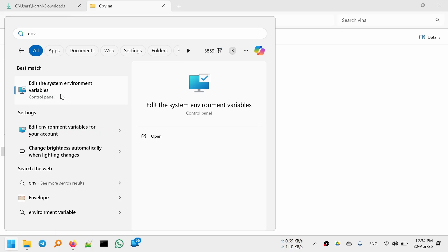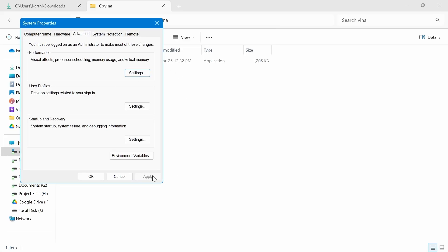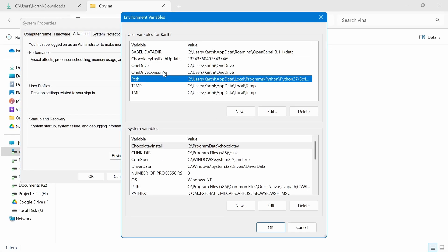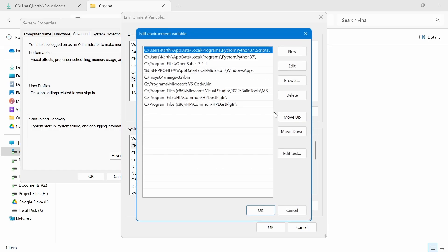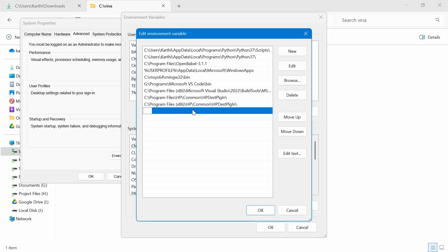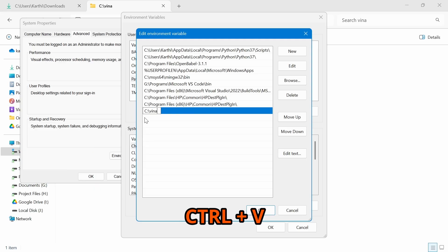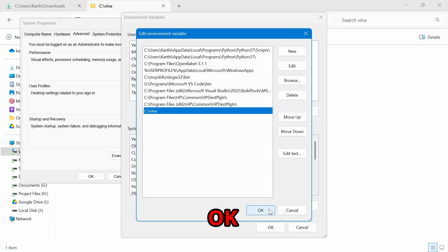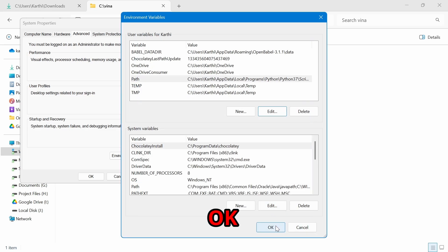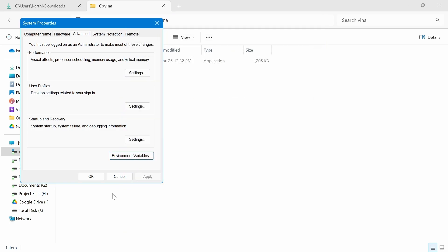Search for environment variables and click on it. Go to Path and click Edit. Click New and paste the path here. Now click OK and OK again. The new environment variable is created, so click OK.